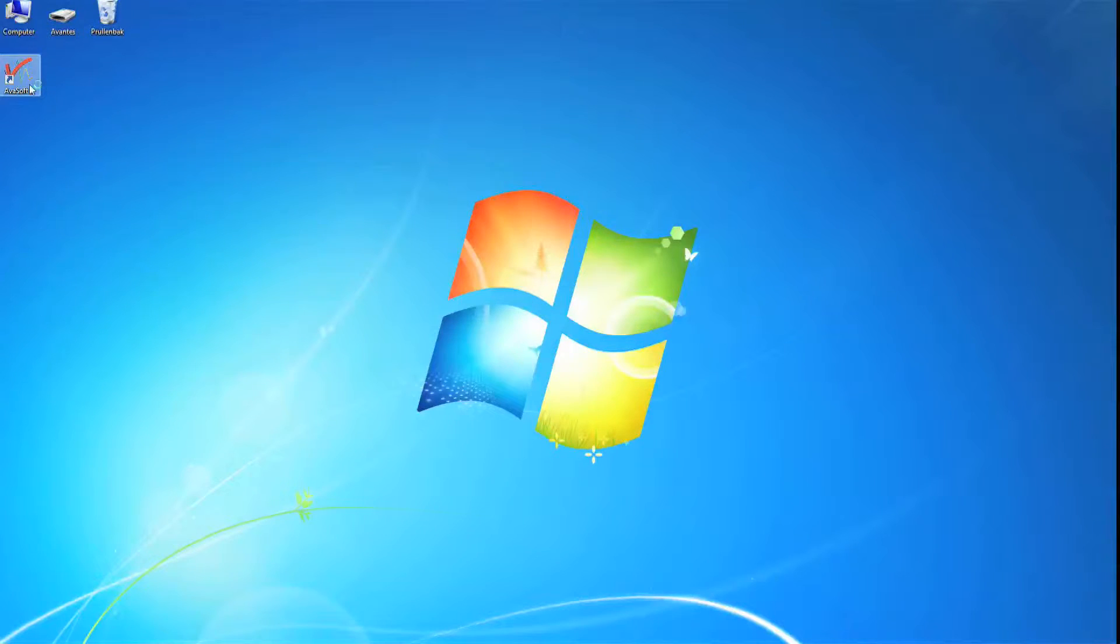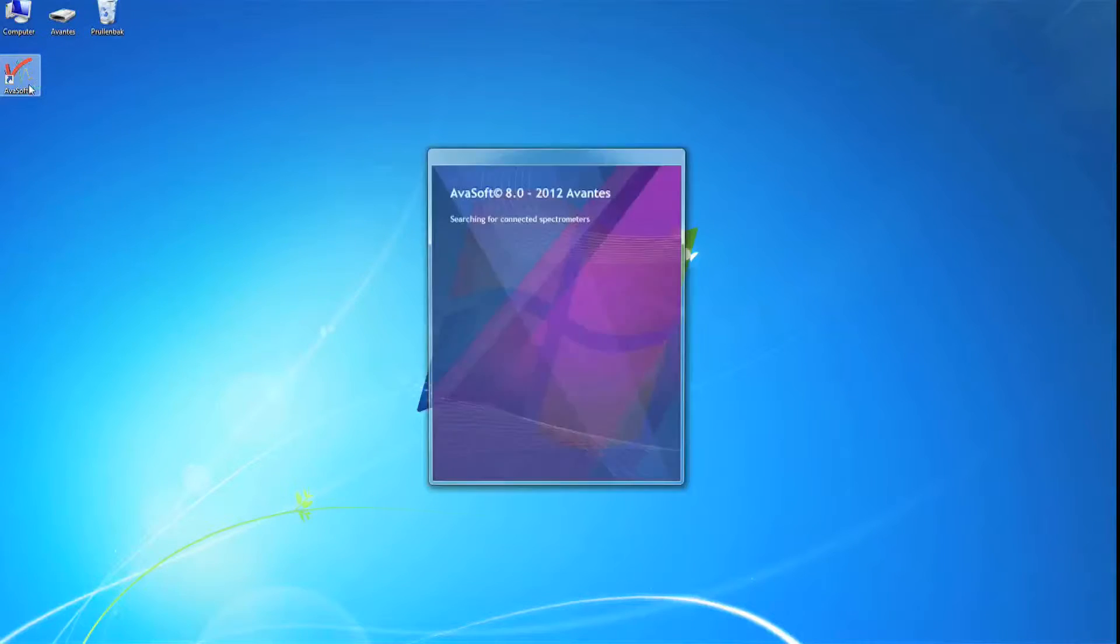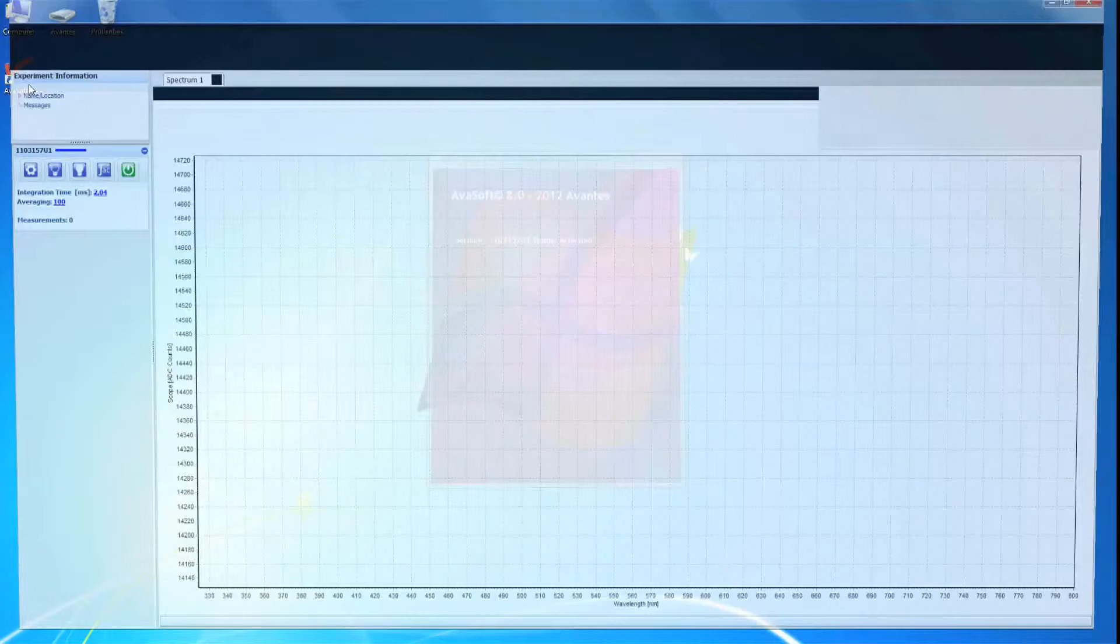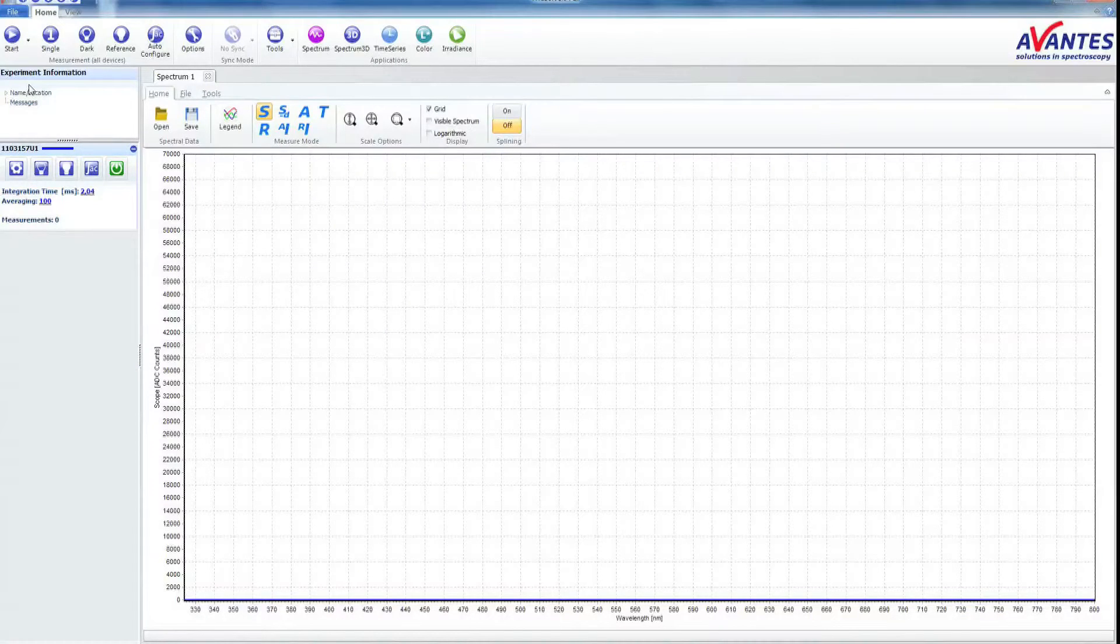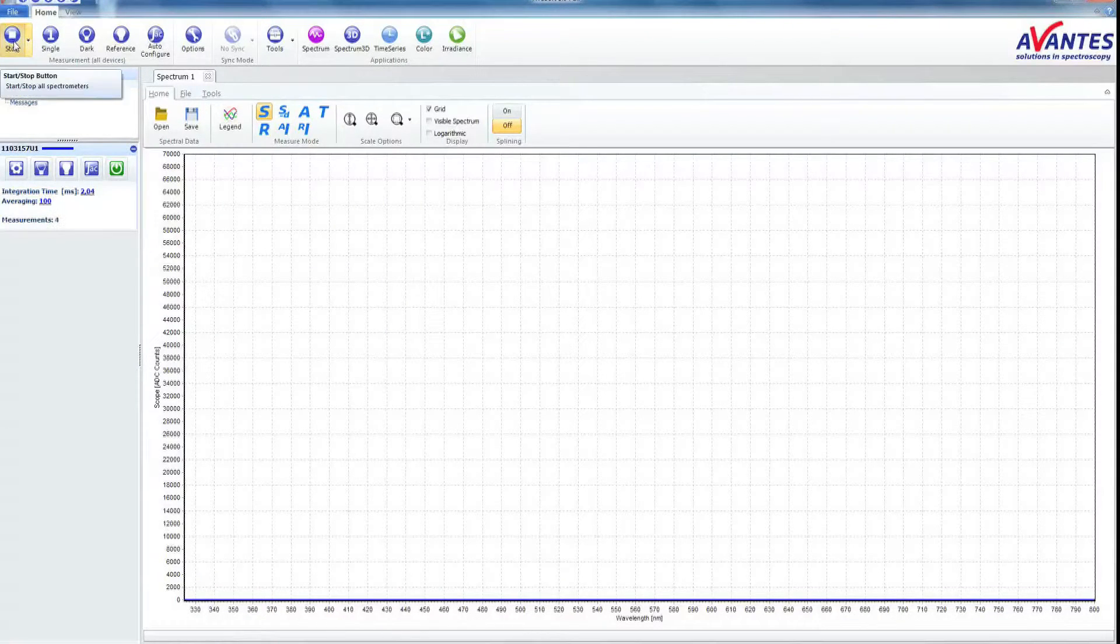Start up Avasoft 8. To start a measurement, click Start in the upper left corner.